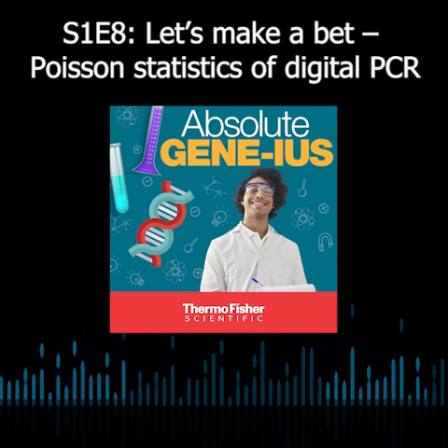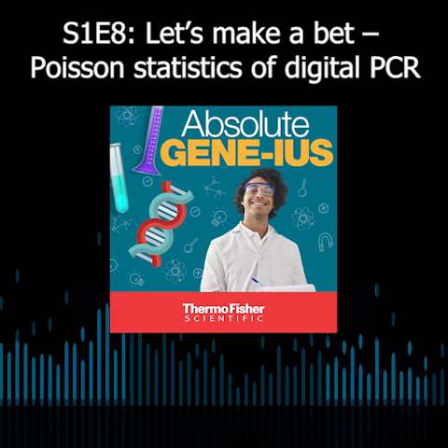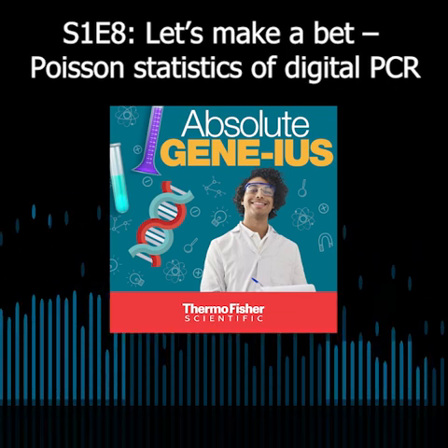So really all we care about is saying what fraction are empty relative to the total. And that's the number that gets plugged into the formula to then spit out a concentration we care about.